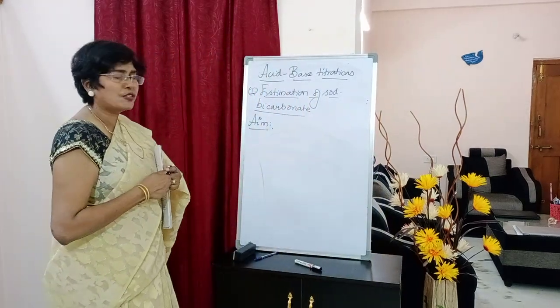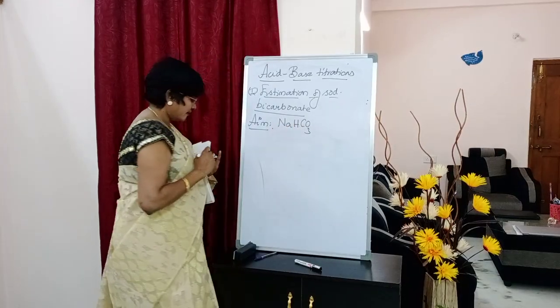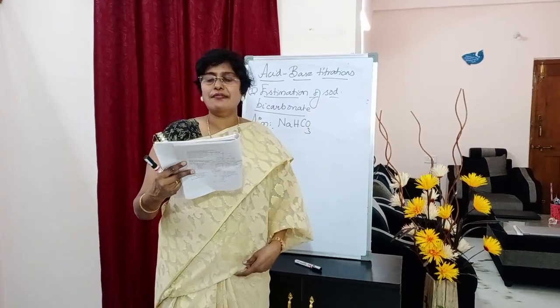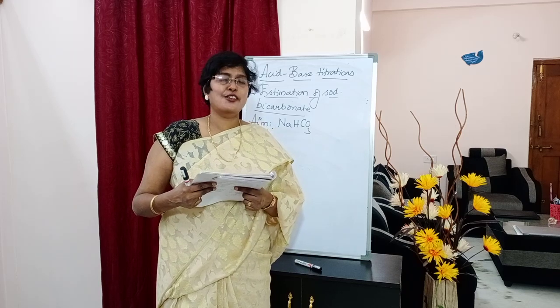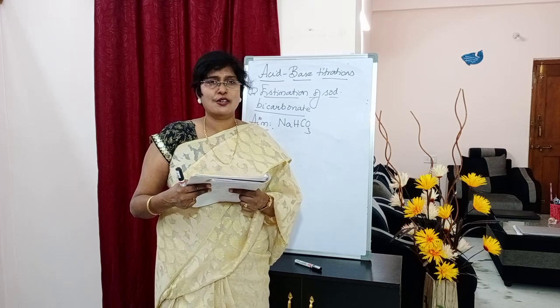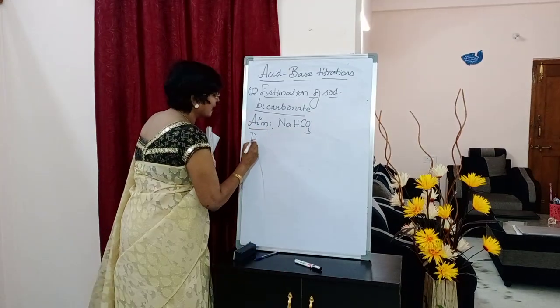What is the formula of sodium bicarbonate, students? NaHCO3. To estimate the amount of NaHCO3 present in the given solution.